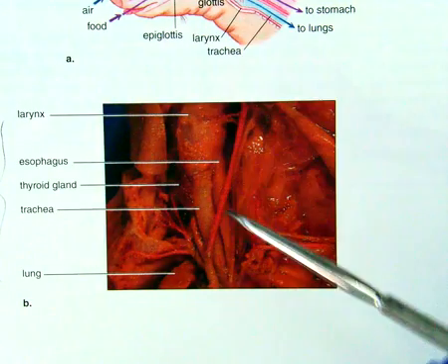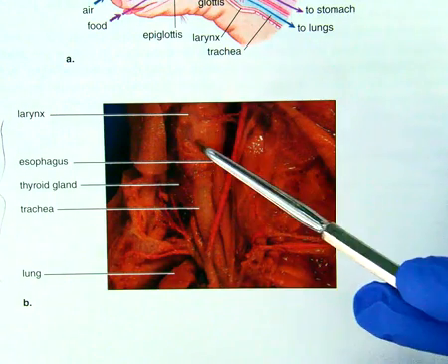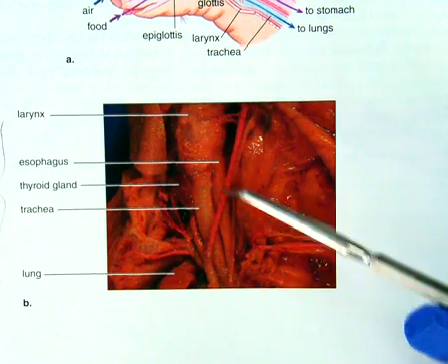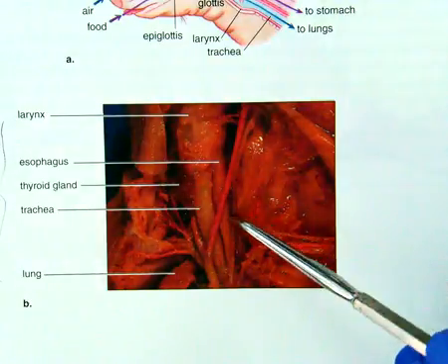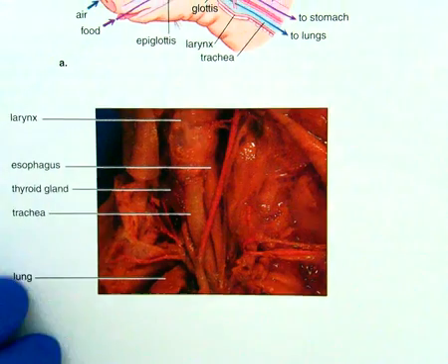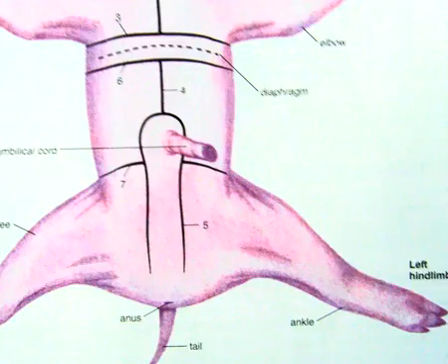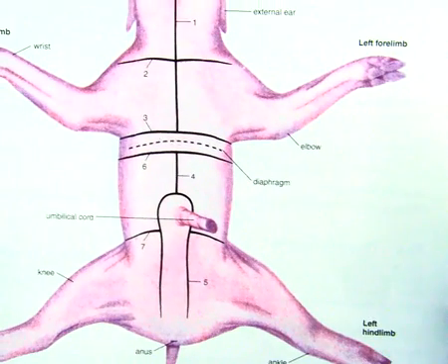We're close up here in the pharynx region, just below the larynx, continuous with the trachea that we'll see. The esophagus is posterior to that, so behind it, more dorsal in a quadruped. You should be able to identify the esophagus. The thyroid might not be evident because it might have been removed by accident. The trachea definitely, and lungs, just like you had to identify the lungs in the frog. This is a dissection that they recommend, and we did in class together.